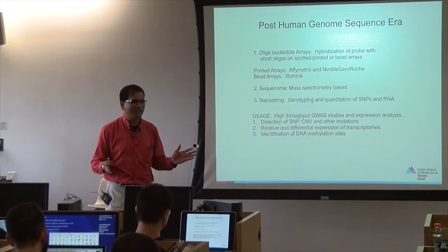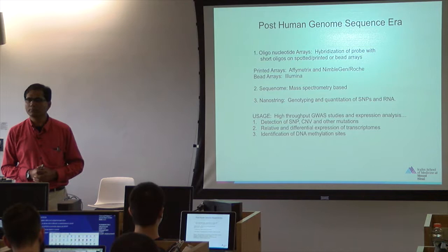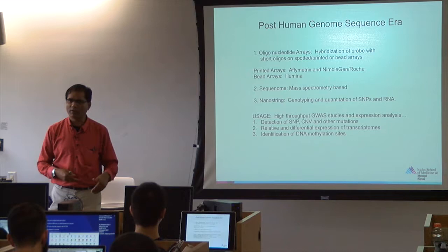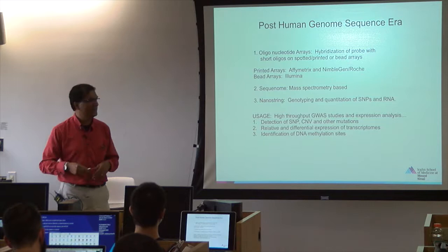A quick question. Biochemically, how do they detect hybridization? Is it very similar to SYBR Green type? Yeah, for instance, label the DNA, detect it. Label the double-stranded DNA, heat and then chill it, make it single-stranded, and then hybridize. Is it fluorescing upon hybridization? Yes. I'll explain to you how that microarray works. Simple thing, right? And then we'll discuss more in microarrays.